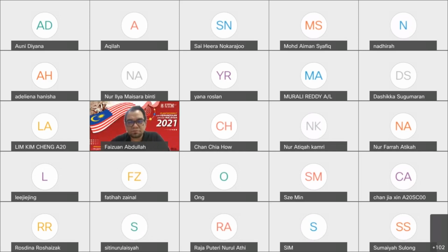Analytical Chemistry Practical. Right. Today we'll do the virtual lab for experiment 3, which is about the determination of zinc by linear calibration and standard addition methods using atomic absorption spectroscopy. So the focus is now on atomic absorption spectroscopy, the instrument and how it works.